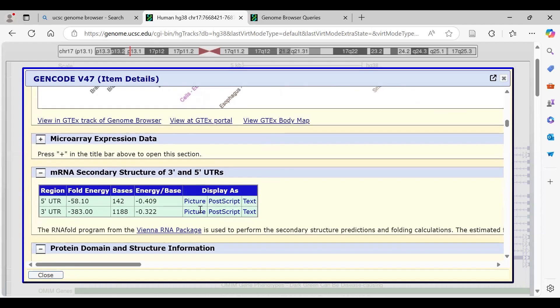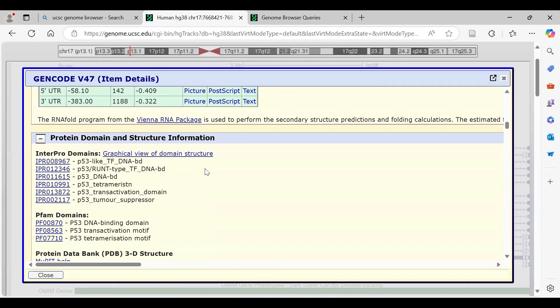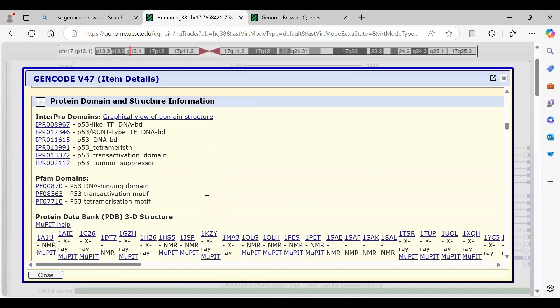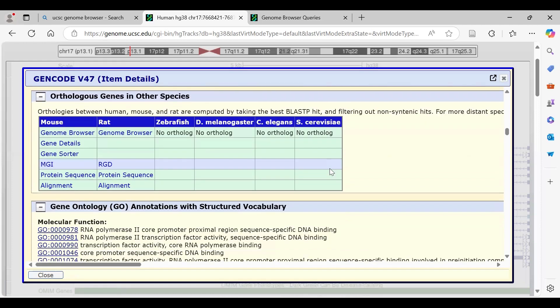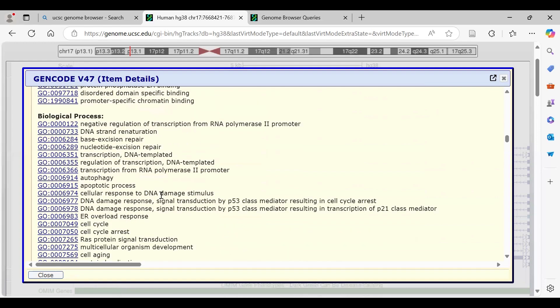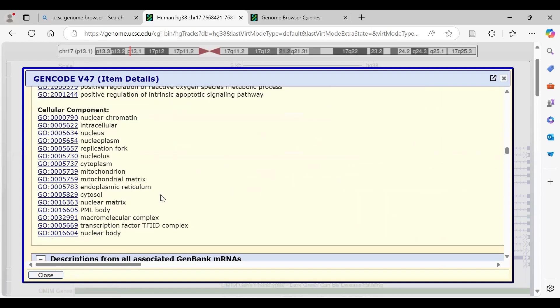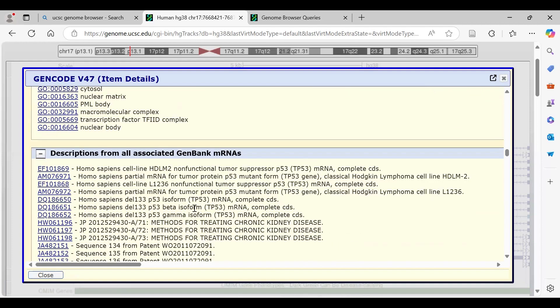Microarray data, if available, will also be present, as well as RNA-seq data — though it is not available here. We also have mRNA secondary structures, protein domain information, protein structures, and PDB 3D structures which can be easily retrieved. Ortholog genes in other species are also available, along with gene ontology covering molecular functions, biological processes, and cellular components this gene is associated with.